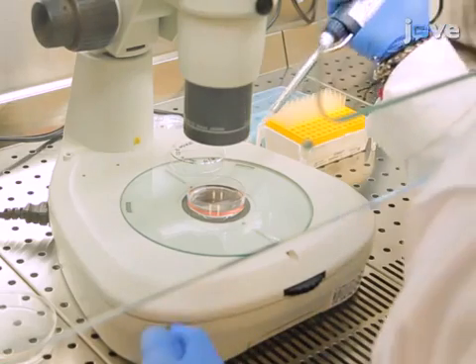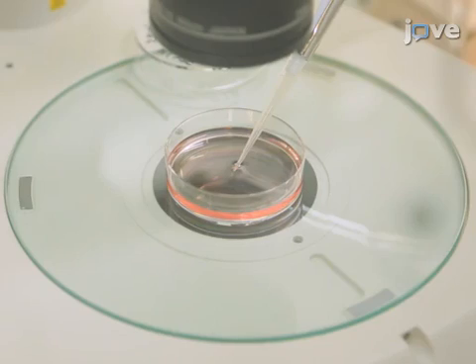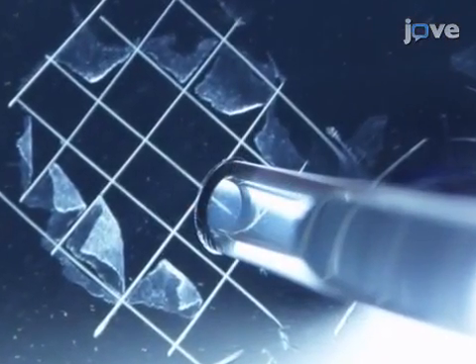Cutting out the colonies requires good manual skills to obtain fragments of equal size. The use of commercially available cutting tools can help. Then use a 200 microliter pipette to detach the colony fragments from the dish surface by gently pipetting the medium underneath to lift the pieces.